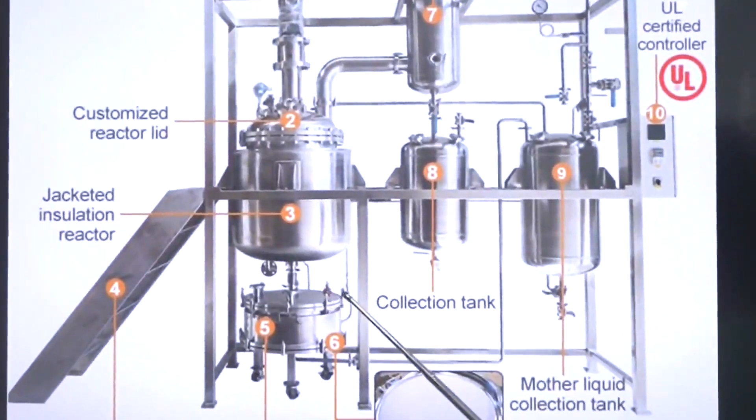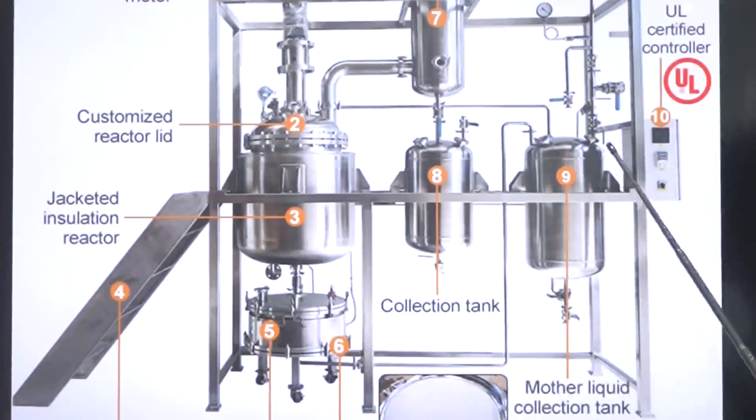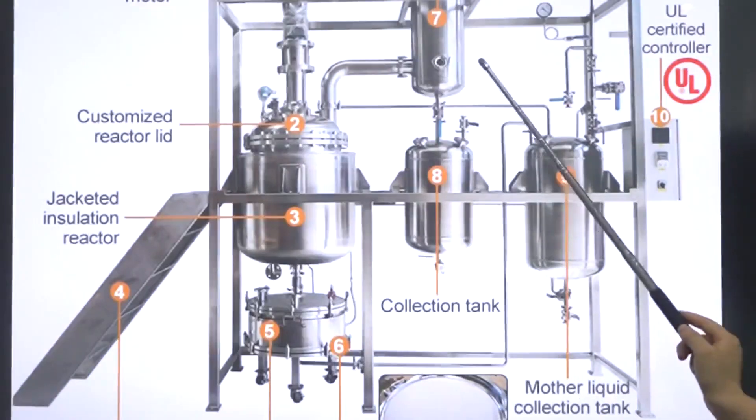This part is the crystal filter tank. The crystal filter is removable, with a stainless steel filter design. Here is our mother liquid connection tank — this is a connection tank under the condenser.